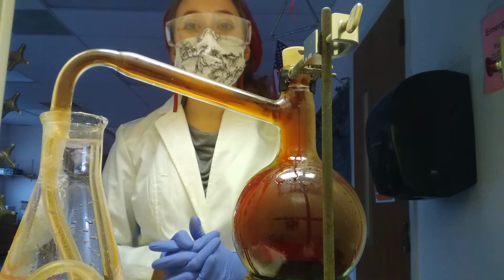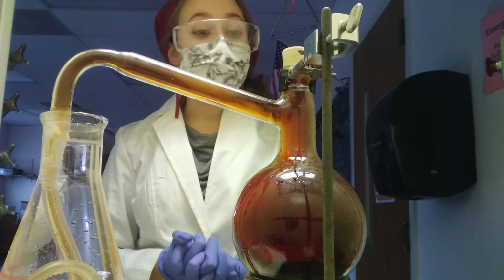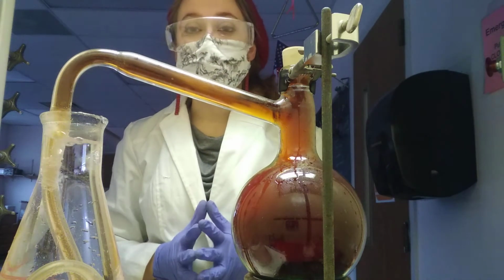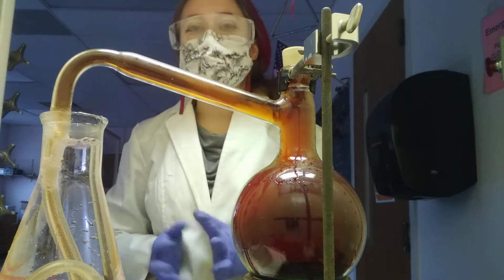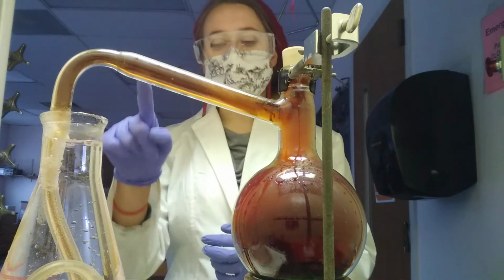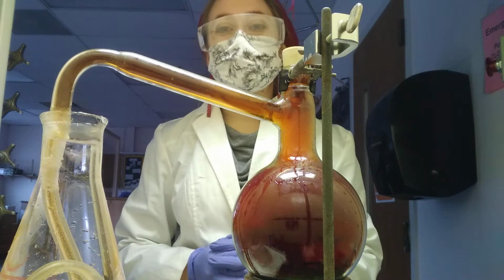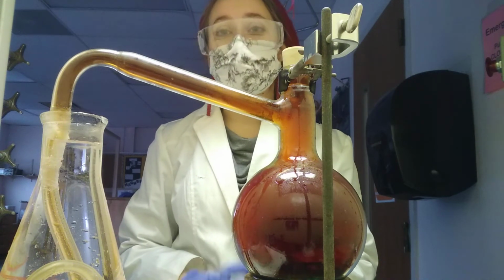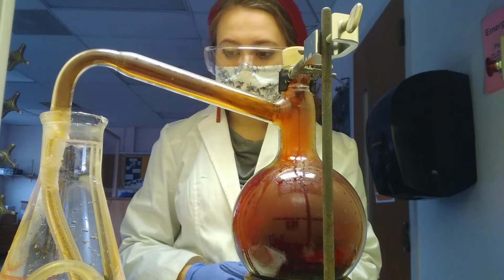What I'd like you guys to do right now while this keeps bubbling for a little while is I'd like you in your notes to draw this apparatus, everything that you see here. You can imagine what the bottom of the flask looks like, but don't just cut it off at the neck. Just draw the rest of what the flask would be. I want you to label everything clearly. You don't need to use technical terms. I want you to use terms you know. But I want you to make as many observations as possible.